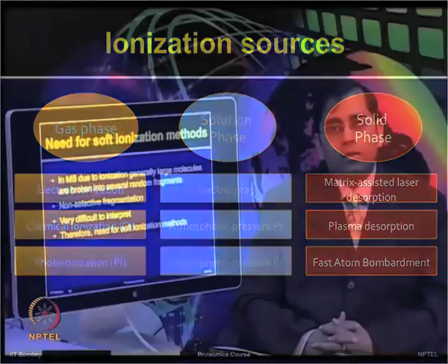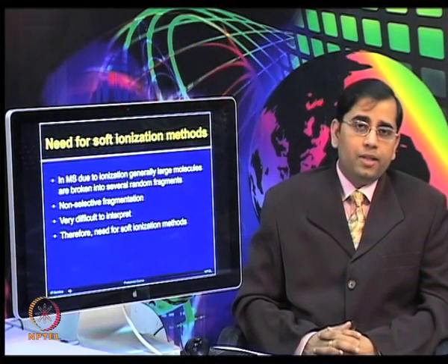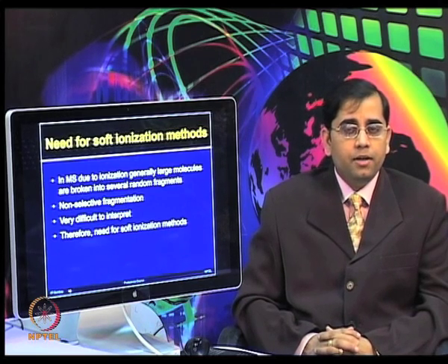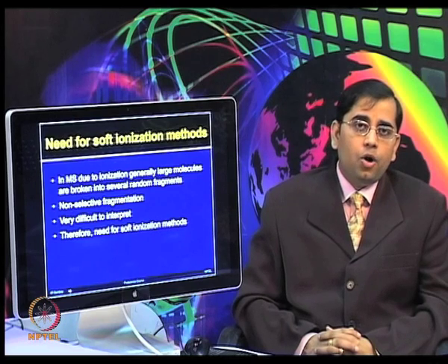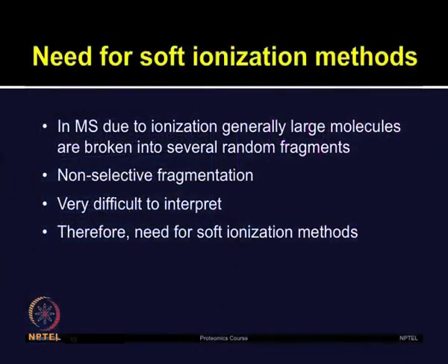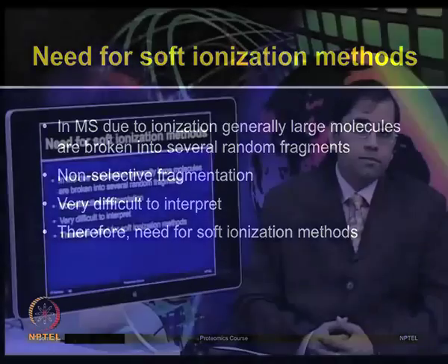The traditional ionization sources used for small molecule chemical applications relied on chemical or electron ionization, but these processes are too energy-rich to ionize intact large biomolecules, and they lead to unpredictable analyte decomposition.